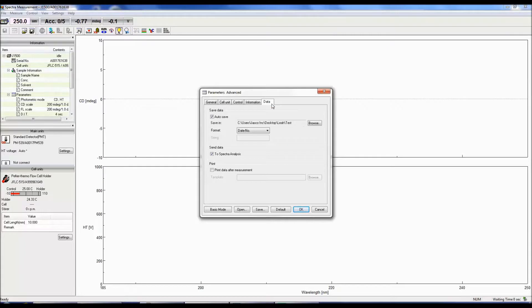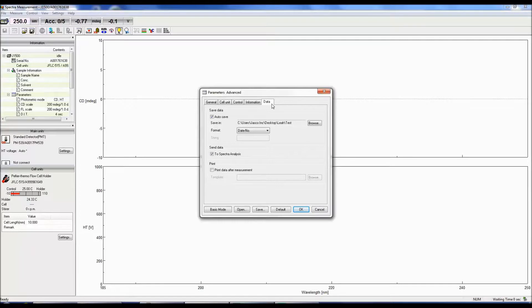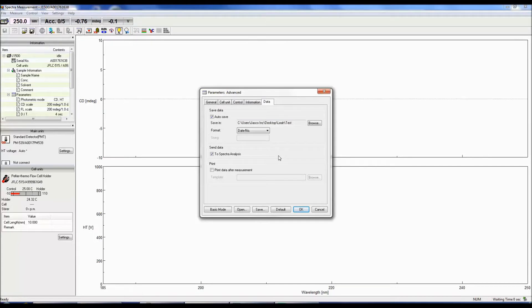The data tab allows you to select whether to automatically save your data as well as to specify which folder to save it to and the format the file is saved as. Saved data can be sent directly to spectra analysis once the measurement is finished and the data can also be printed.